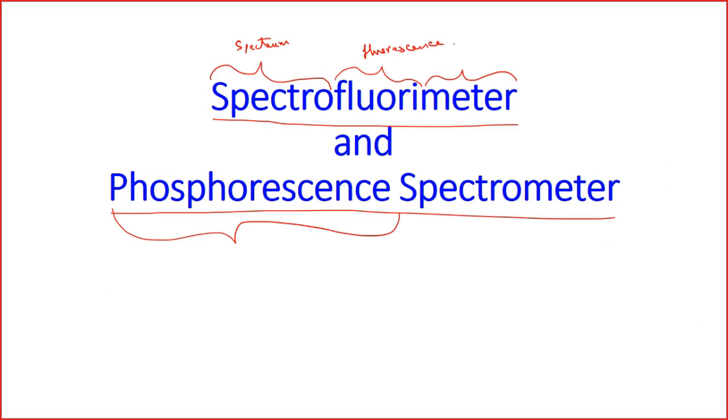Can we use this fluorescence technique for DNA sequencing? Because as you have mentioned, the purine and other bases can show fluorescence. So can we use this technique for DNA sequencing, like studying the spectrum of the different bases like purine and then doing the DNA sequencing?